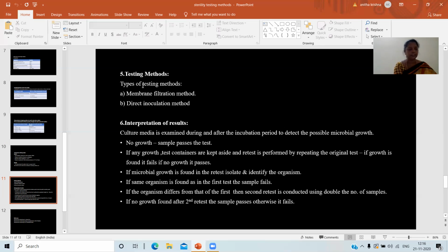Whatever membrane filter you are using for the sterilization procedure should have a pore size of not more than 0.45 micrometers and a diameter of 47 mm. That is the standard measurement used for selecting a membrane for performing your test for sterility.